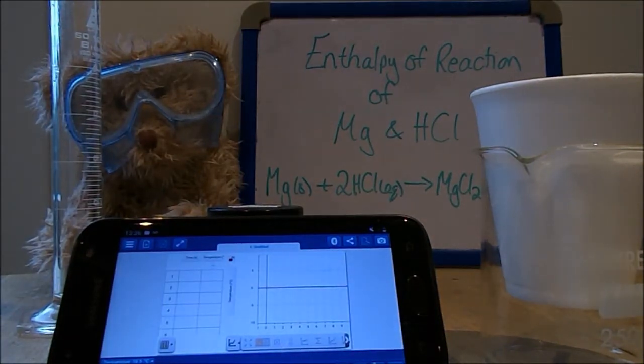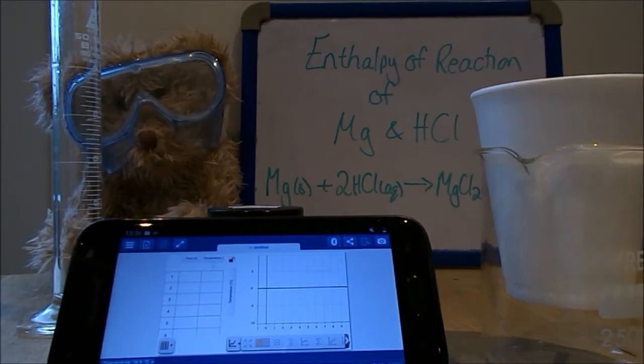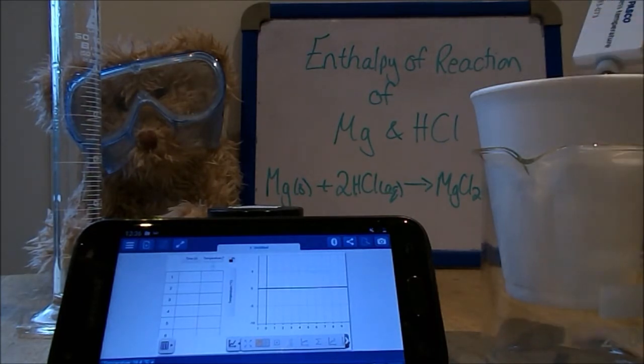Now we're going to do these temperature measurements to find the temperature change in the reaction by using what we call a cooling curve. So we're going to use the temperature probe to measure the temperature every 30 seconds until we get to 2.5 minutes. At 3 minutes, we're going to add the magnesium turnings. So the data probe will be logging the temperature throughout. And then we are going to carry on for further time periods of 30 seconds until 8 minutes have passed in total. So we need to put our data probe in there.